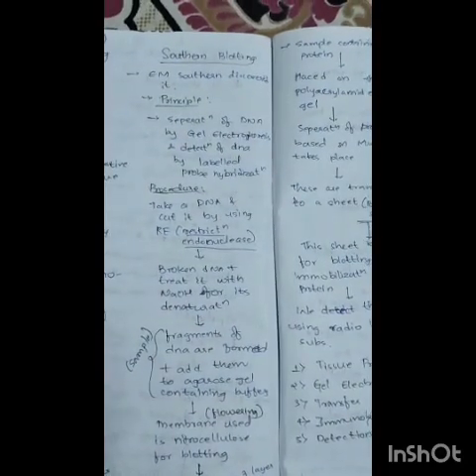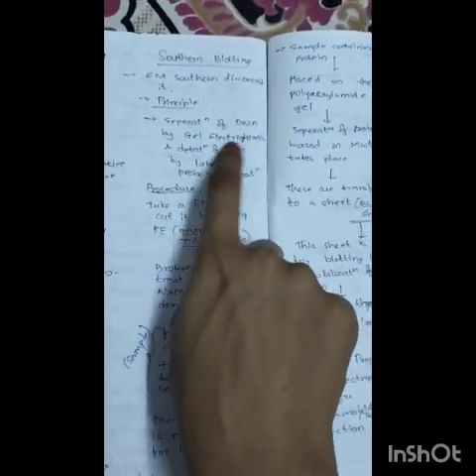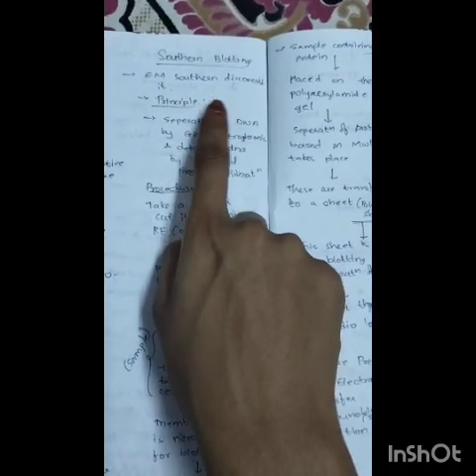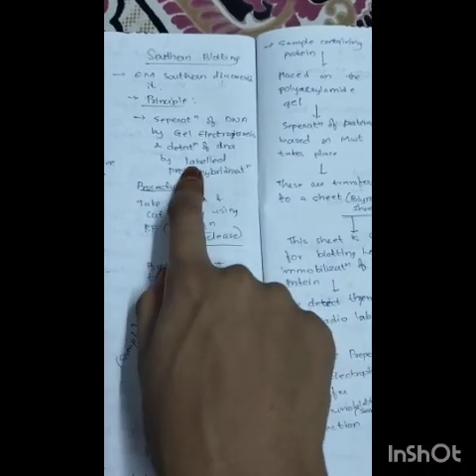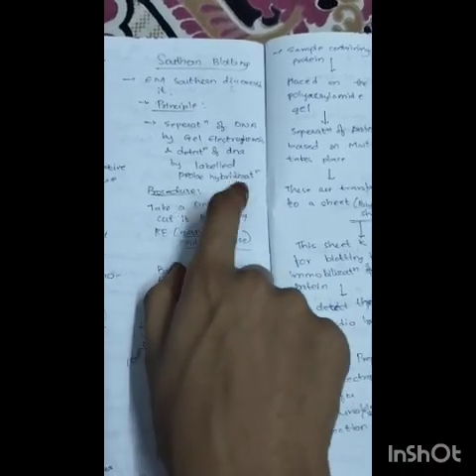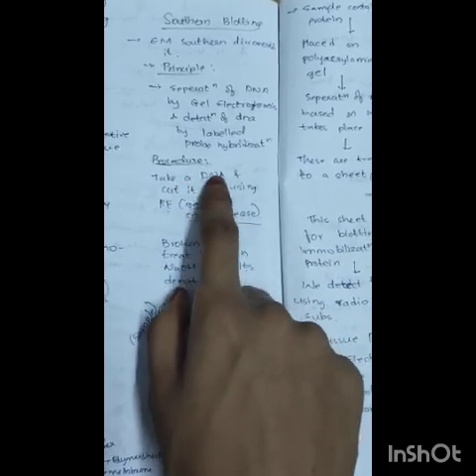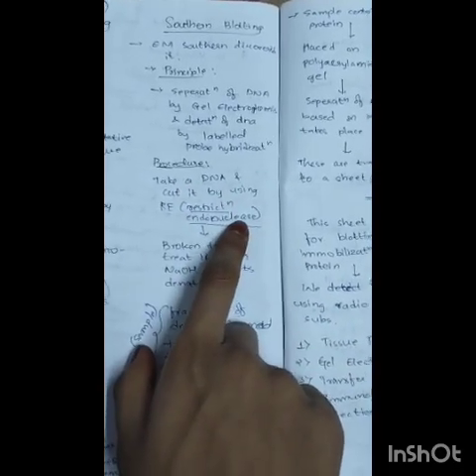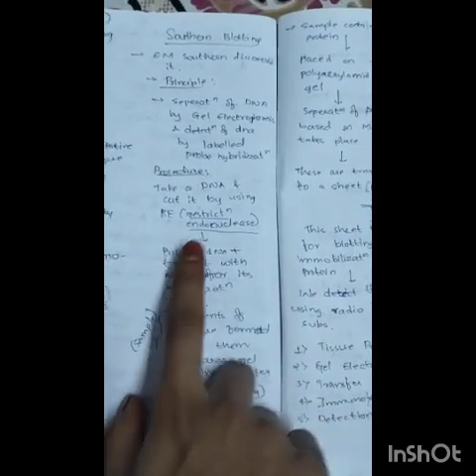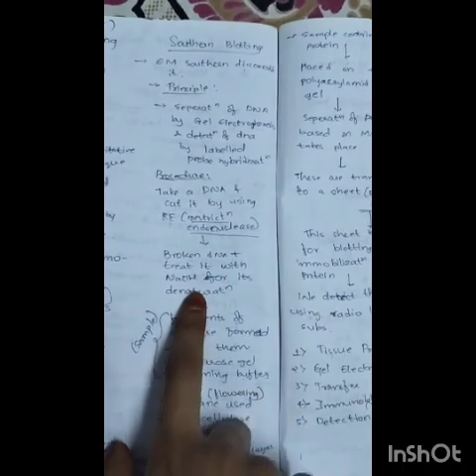It is similar to ELISA but slightly different. The principle is the gel electrophoresis method, by which DNA is separated and then detected using labeled probe hybridization. Now the procedure. Firstly, we take DNA and cut it using restriction endonuclease. The DNA is broken, and then the broken DNA is treated with NaOH for denaturation.